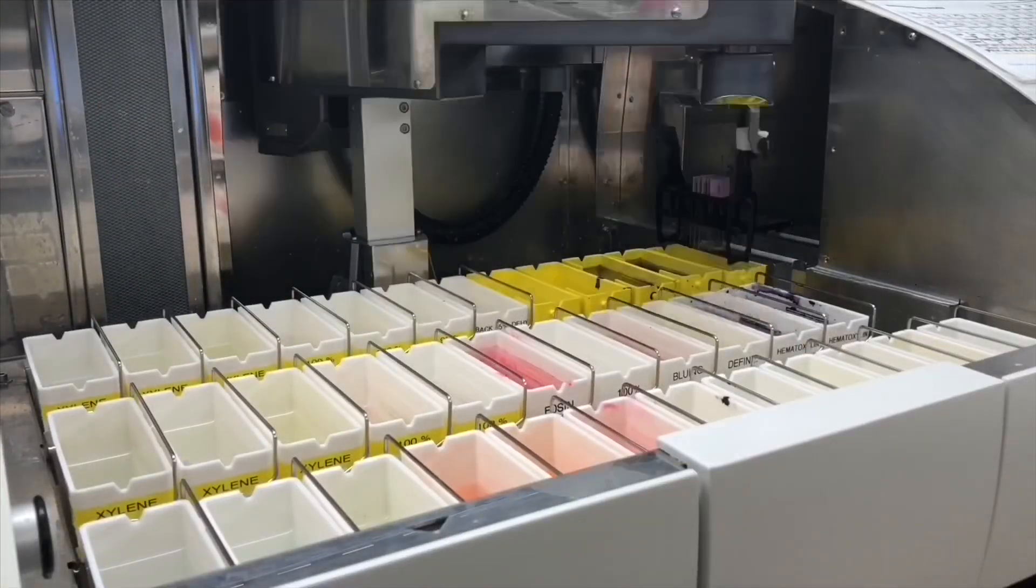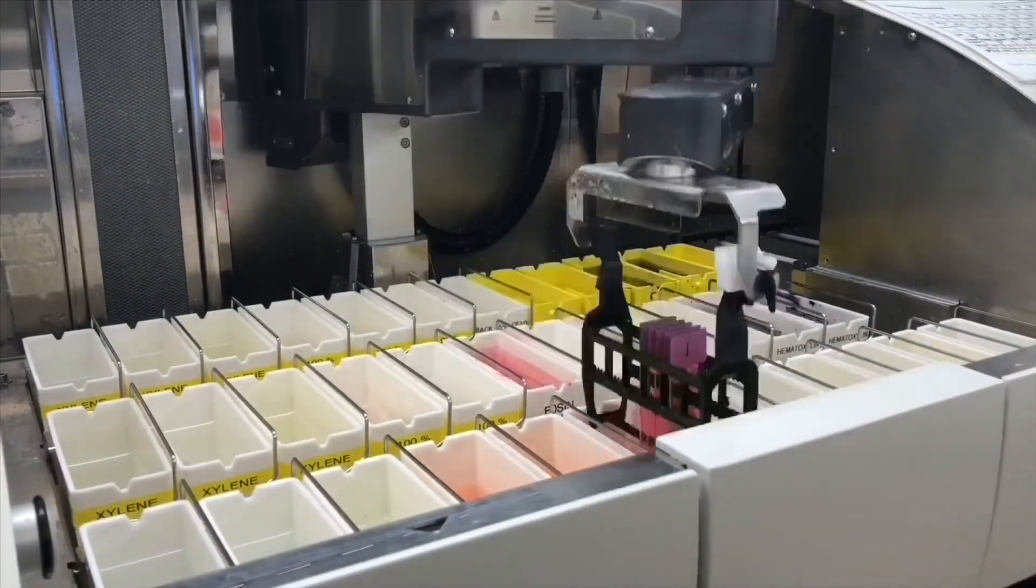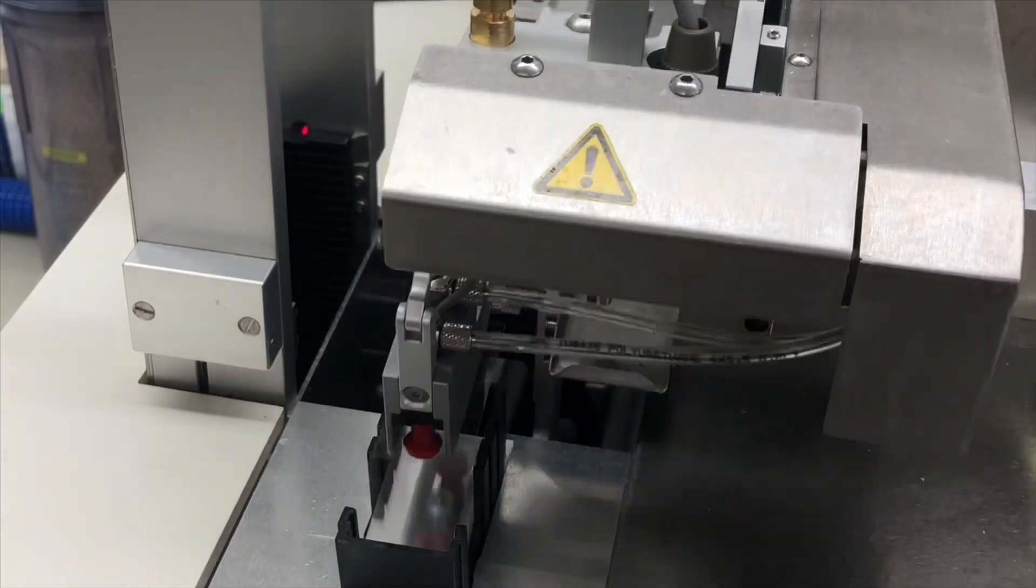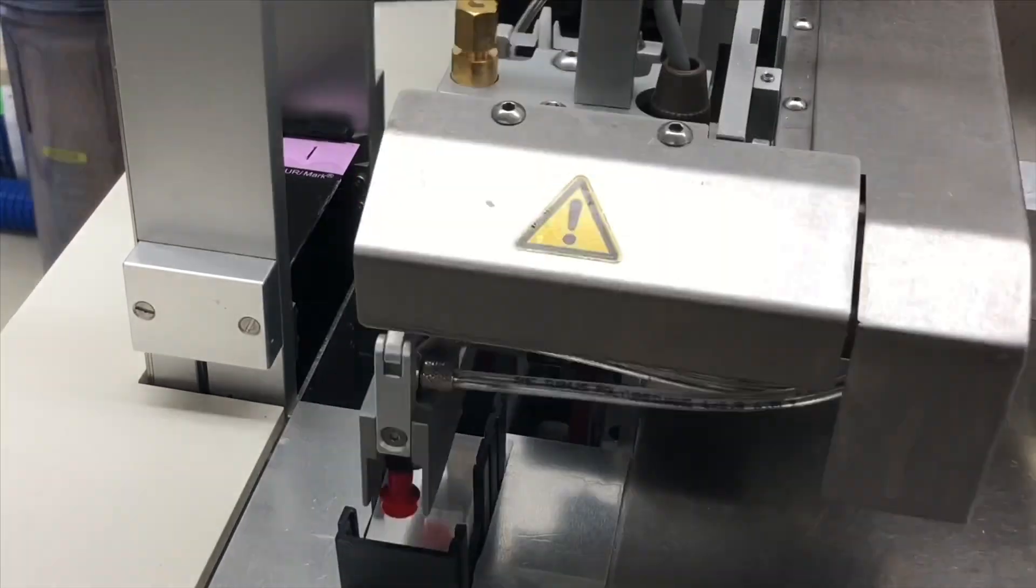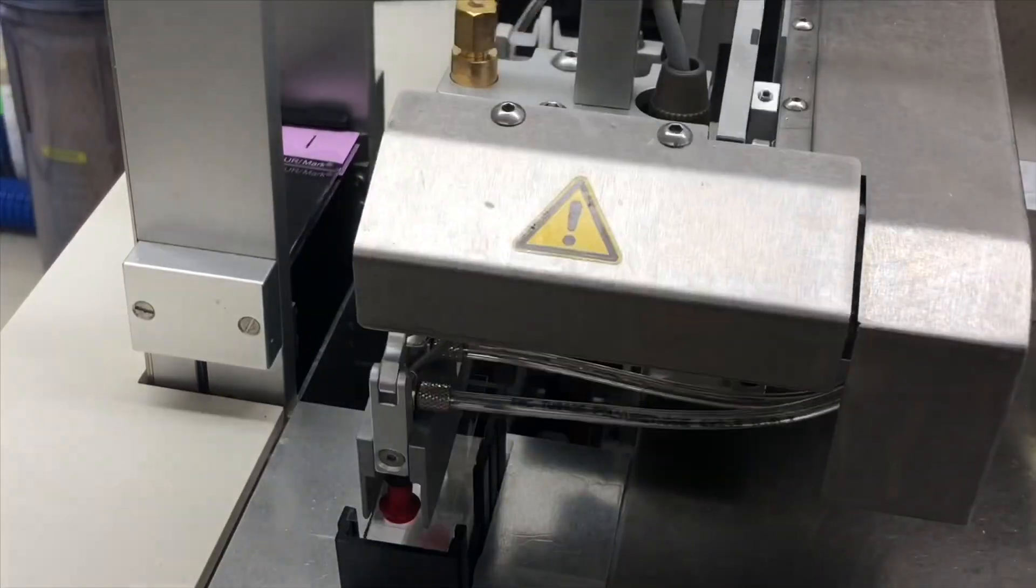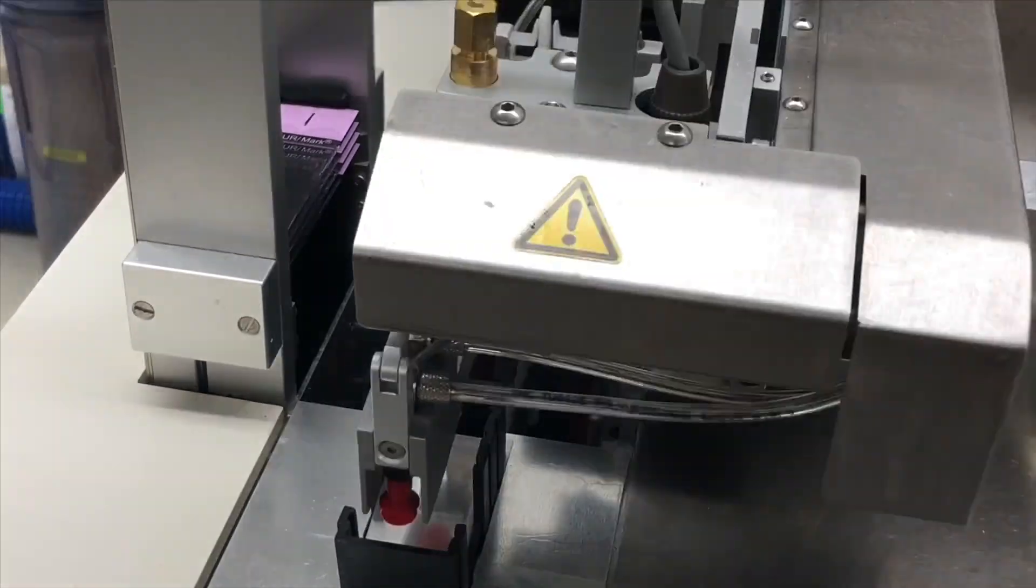The slides are placed in batches of 30 onto our automatic stainer for our H&E stain, hematoxylin and eosin. Once the stain is complete, the slides are coverslipped. Coverslipping under a clear piece of glass allows the pathologist to see the tissue under the microscope.